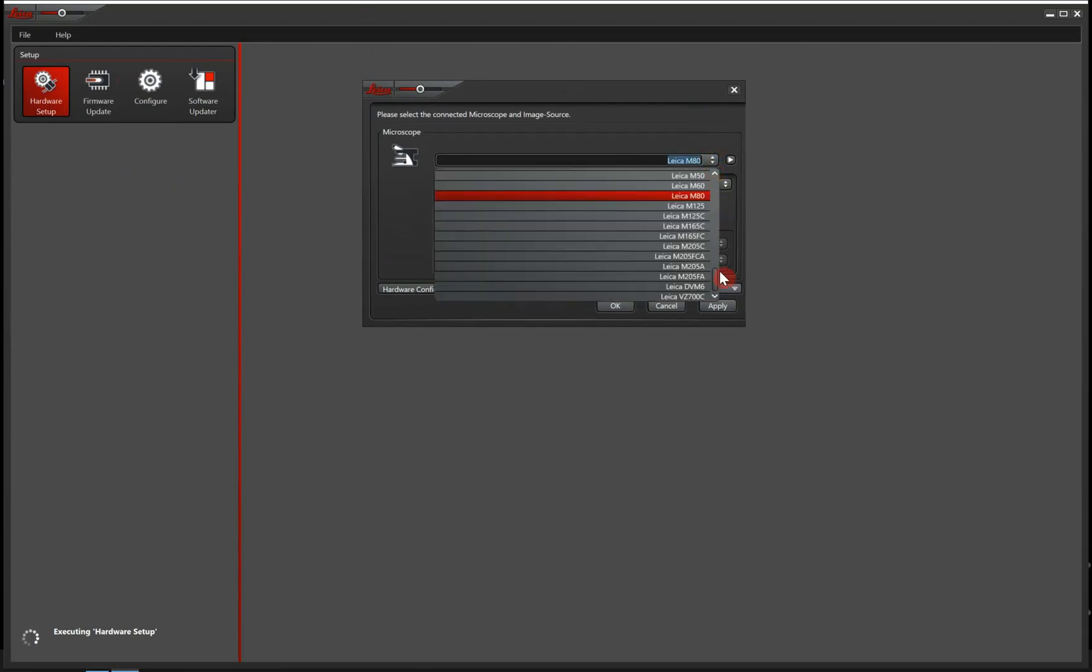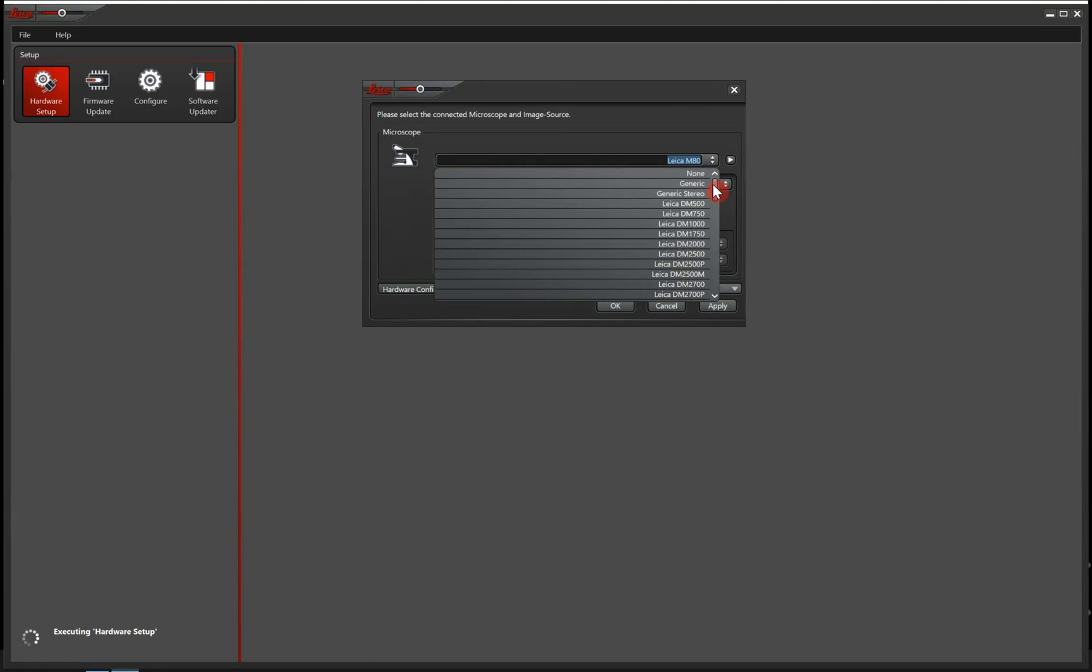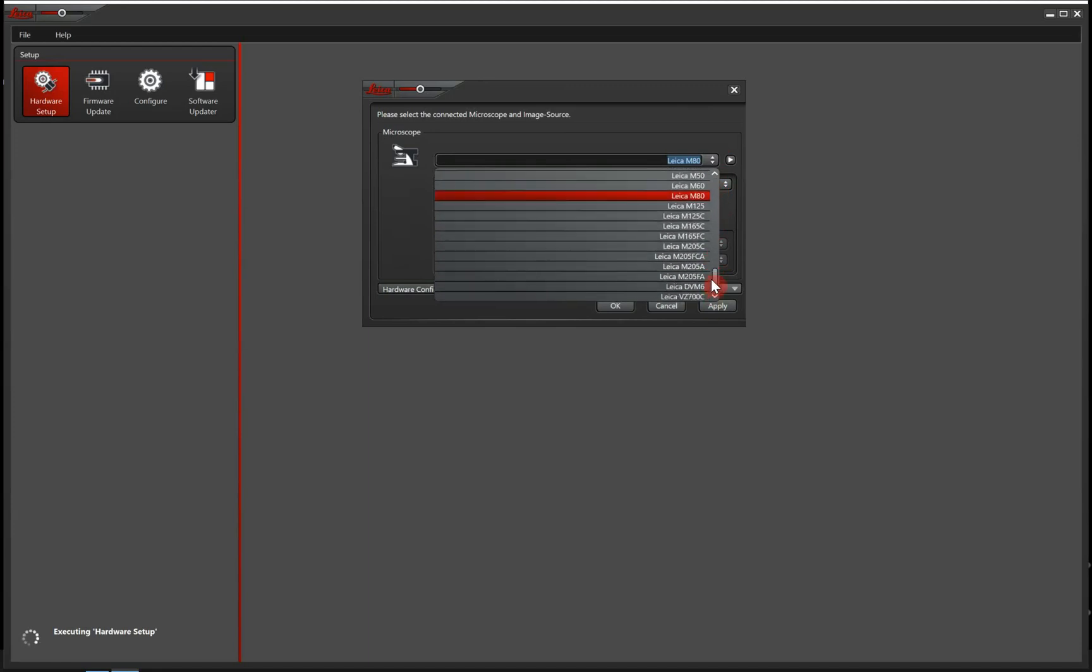In this step, we will tell the software what microscope we are using. In this list here, you have a bunch of stereo microscopes and compound microscopes and digital microscopes as well.